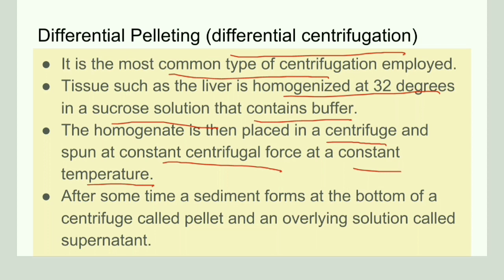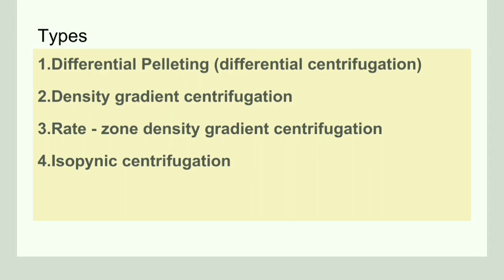After doing it, we get a sediment, which we call a pellet, that settles at the bottom of the centrifuge. So a sediment is obtained as well as a supernatant.